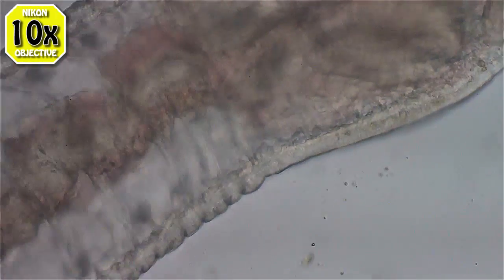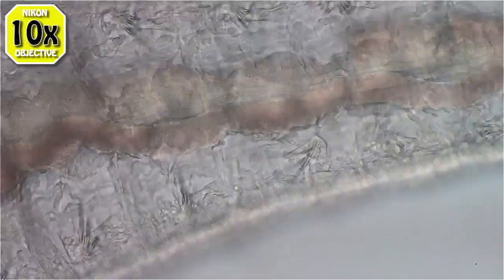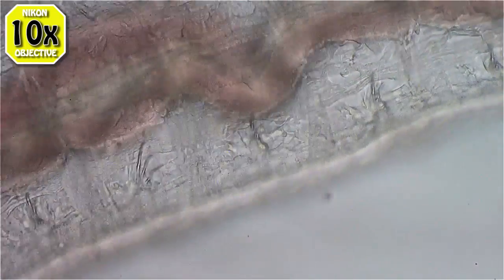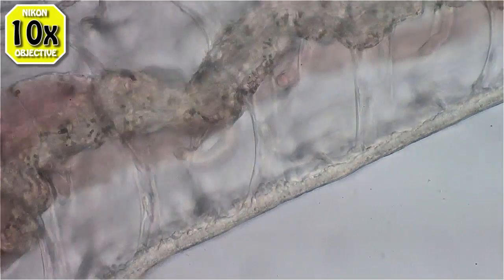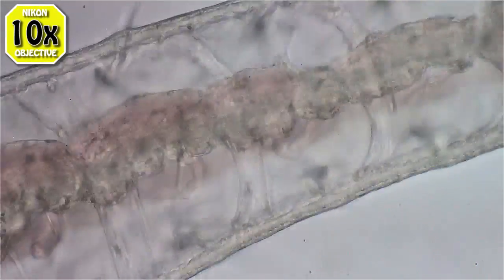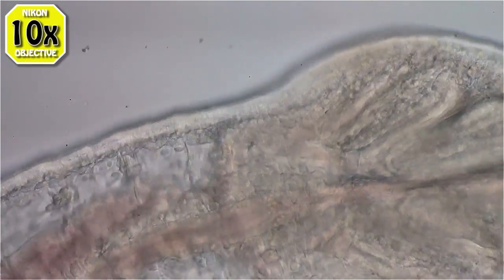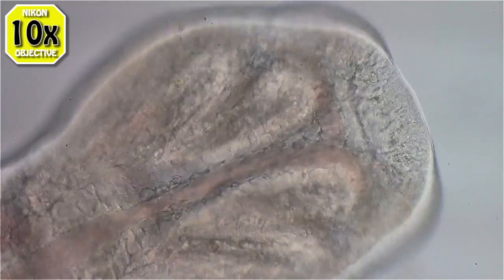And it looks like some of them, I'll just switch to 20x here, Nikon 20x plan Apo lens. Now you can see the sections inside the body. The segment dividers I guess.